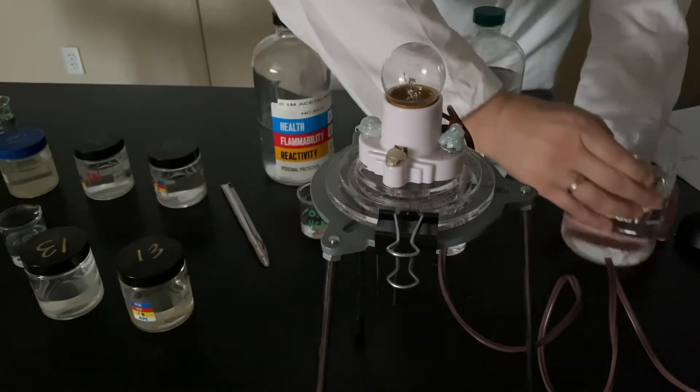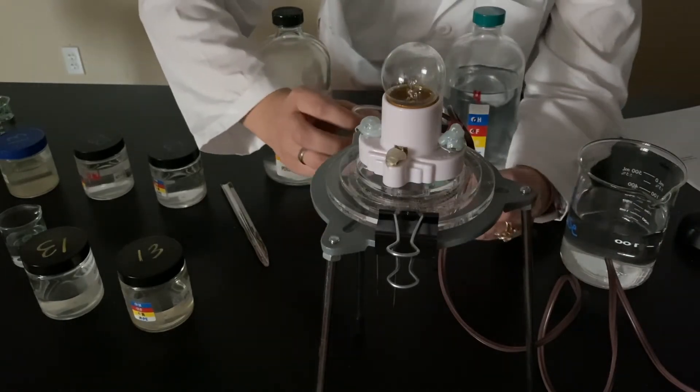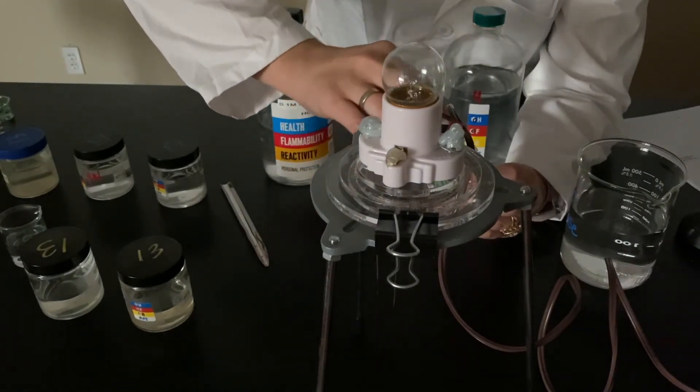D.I. rinse. And then we're going to mix them together, see if there's a double replacement reaction that occurs. So I'm going to pour the acetic acid into the ammonium hydroxide.